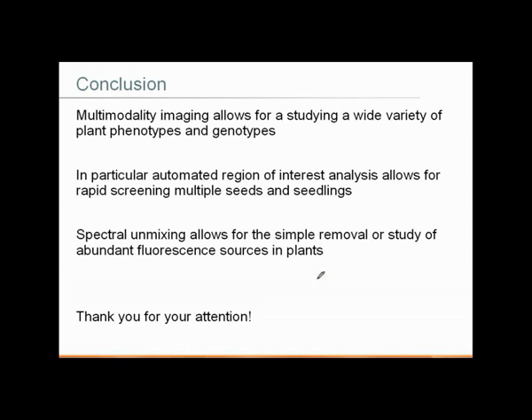So in conclusion, I hope I've piqued your interest in a multimodality system for looking at a wide variety of plant phenotypes and functional genomic studies, whether you're looking at changes in seed viability, or molecular pathways that can be studied with fluorescent proteins or luciferases.